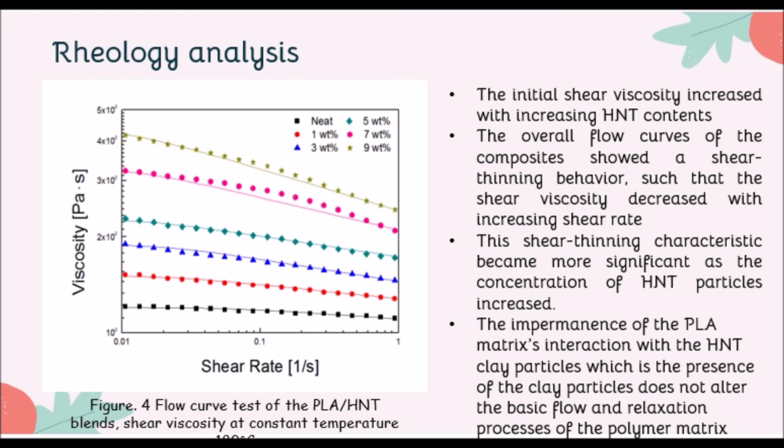This shear thinning characteristic becomes more significant as the concentration of the HNT particles is increased. The presence of the clay particles does not alter the basic flow and also the relaxation process of the polymer matrix.